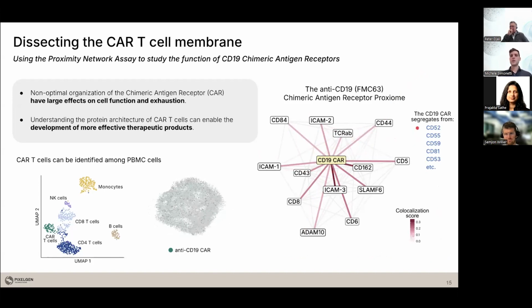But you can also see what's segregating from the marker. In this case, it's lipid raft. And this is something that's common with TCR alpha beta, which, by the way, was also co-localizing with the receptor, telling you probably that they share some spatial patterns together.